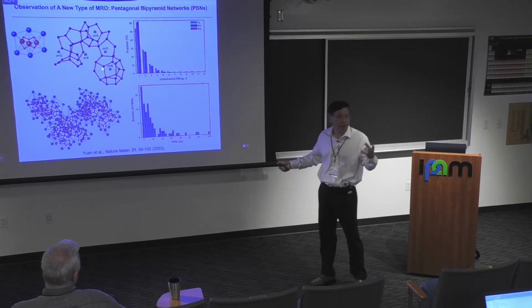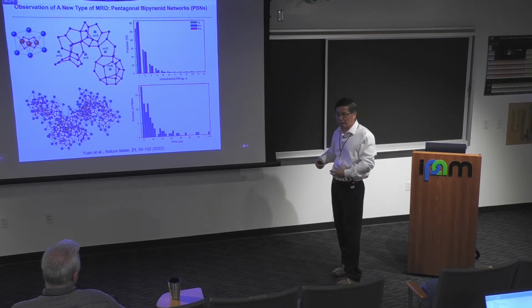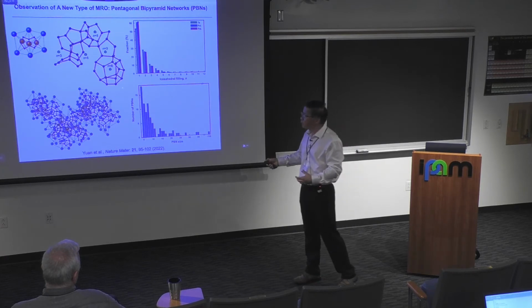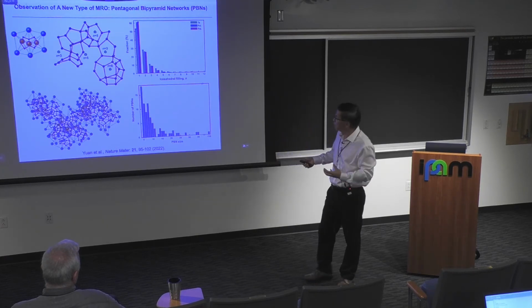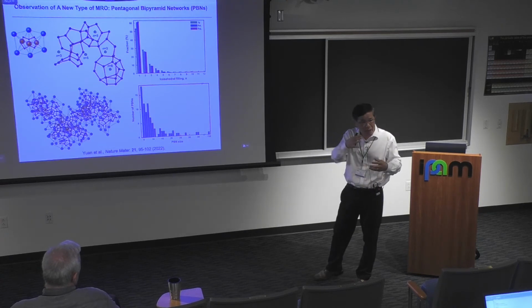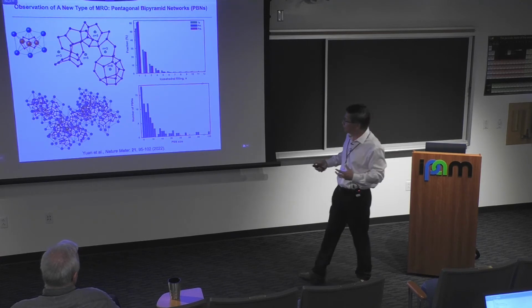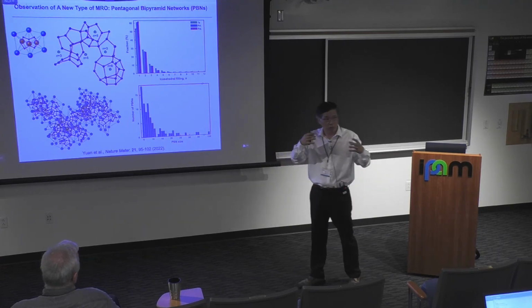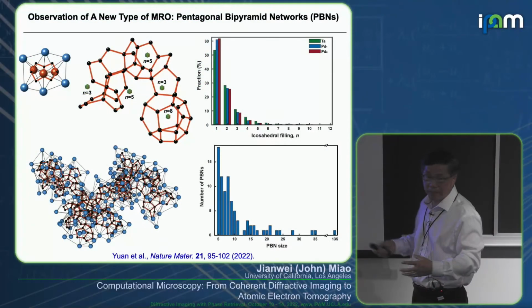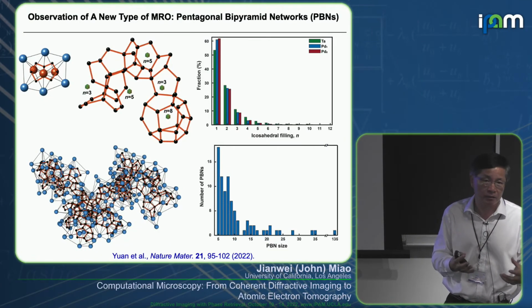Each one is a partially filled icosahedron, not a full icosahedron. But when you really transition to glass, they have more and form this icosahedron completely. And we actually observe, in molecular dynamics simulation coupled with our experiment data, we confirm that that's the case. Icosahedron is definitely, locally, density packing.